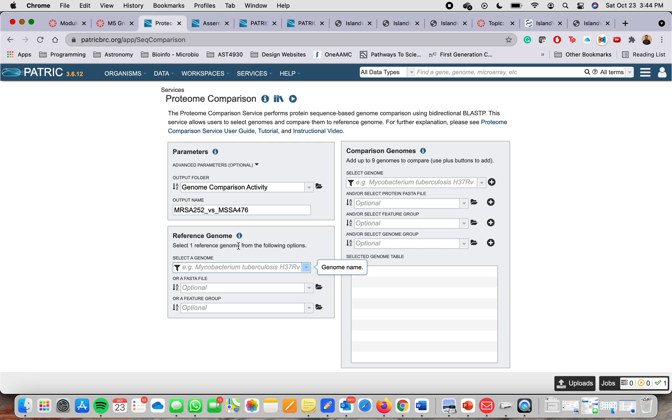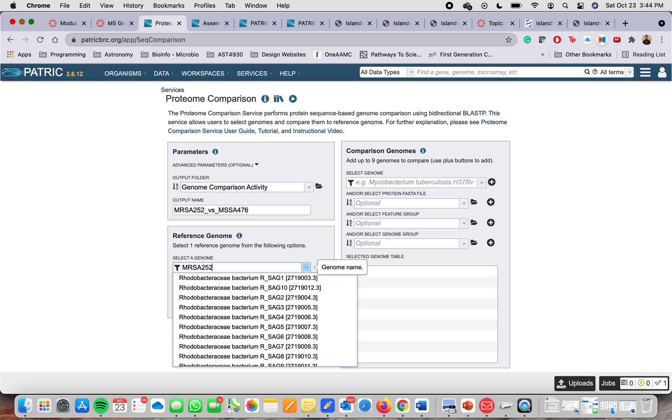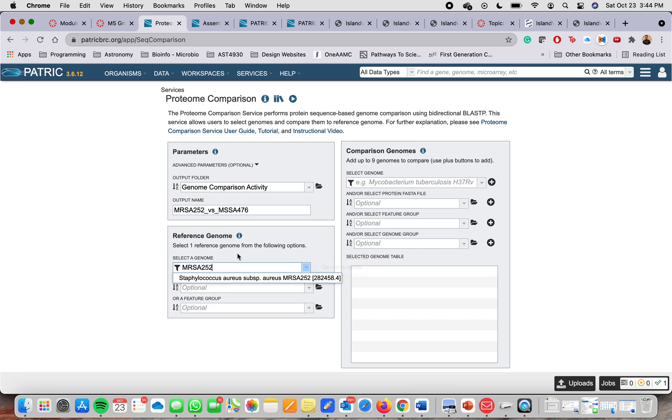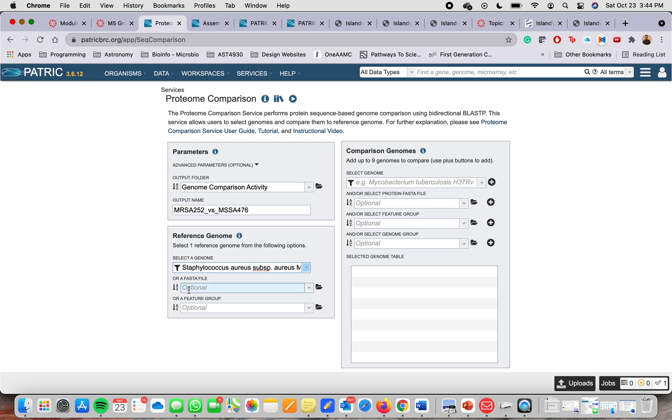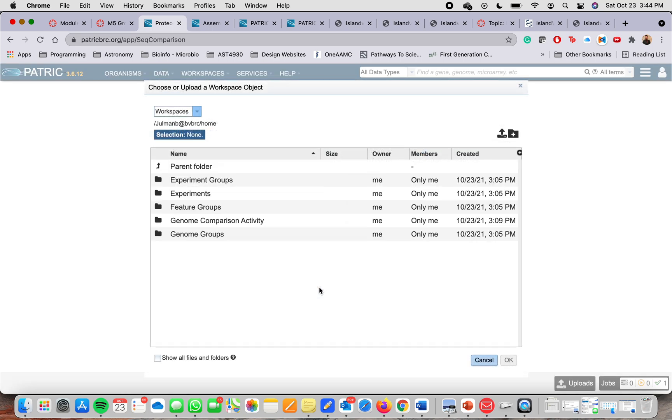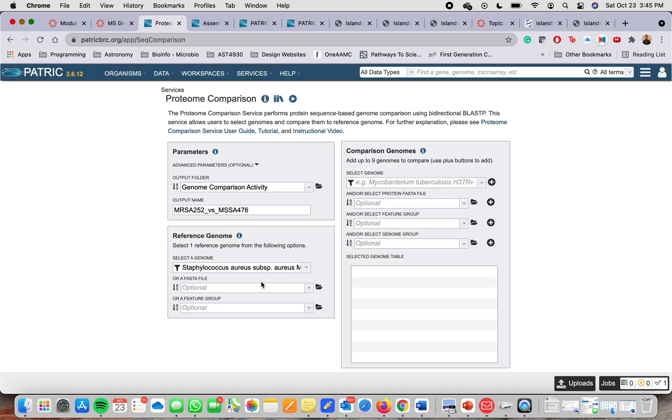And then in the reference genome window, you want to type the name of the organism you're interested in. Like before, it will pop up there. You click there. And then you also have the option, if you don't know the name of the organism, the name of the strain, or if you only have the sequence in FASTA format, you can upload your file here. You're going to click on this folder and then you want to look up your file. You can also do a feature group in case that you don't have the name or the sequence in FASTA format.